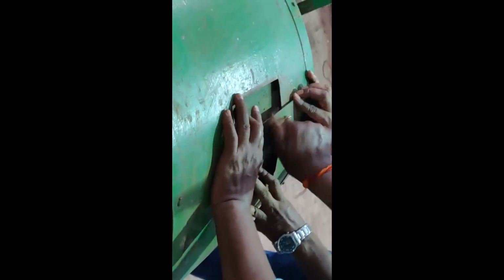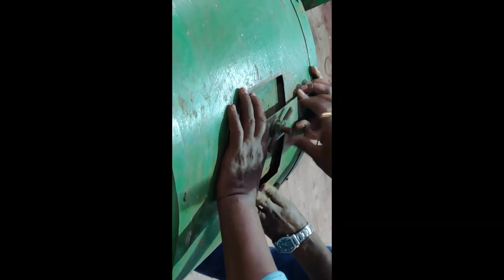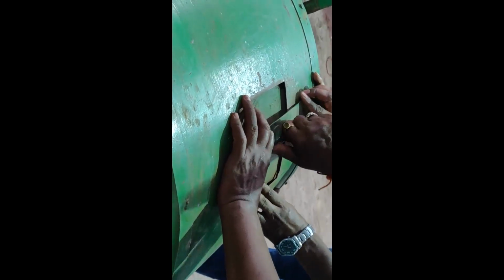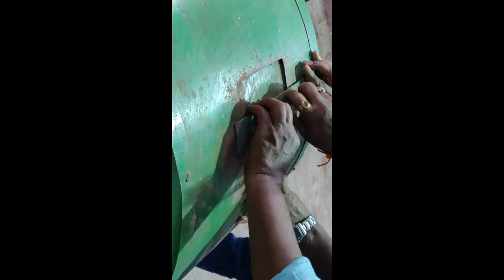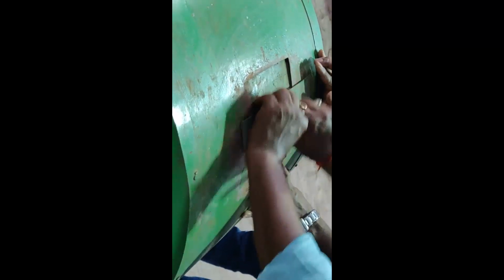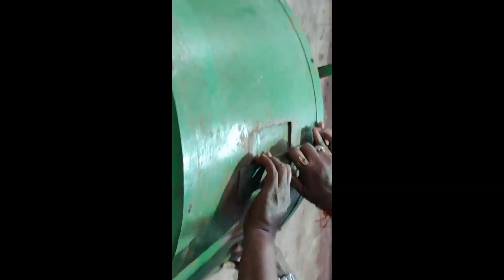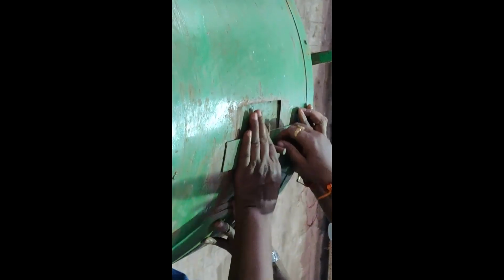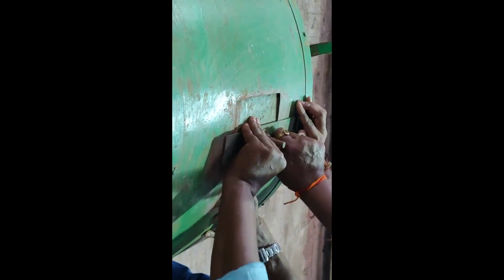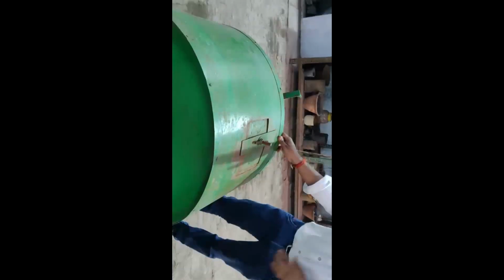After closing the door, we have to give it 200 revolutions to calculate the tumbler index and abrasion index. This is not a motorized setup, that's why you have to do it manually. So we start the 200 revolutions.